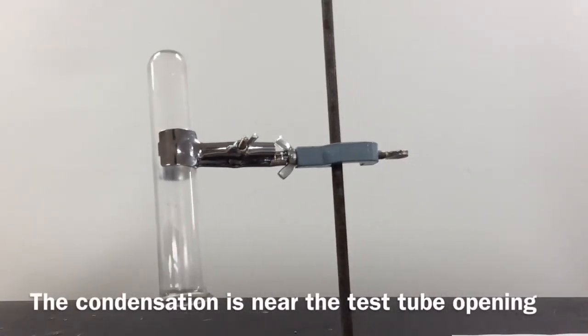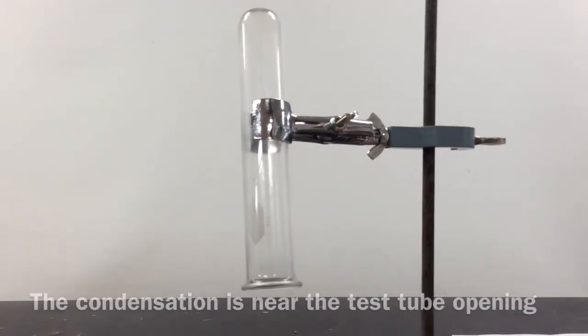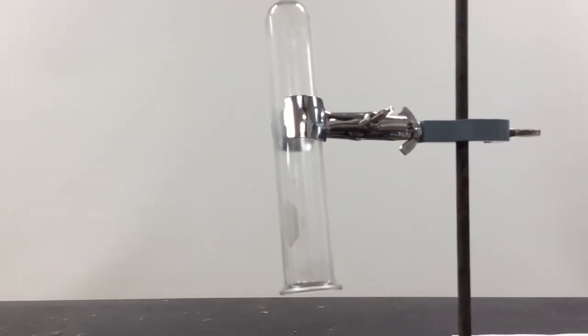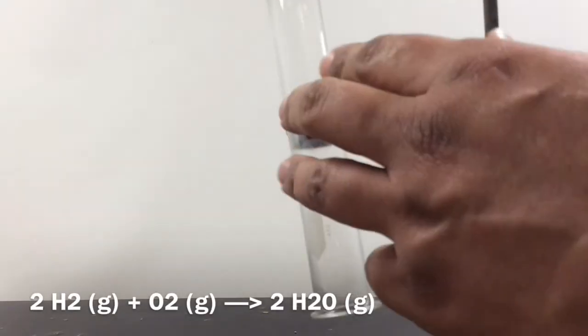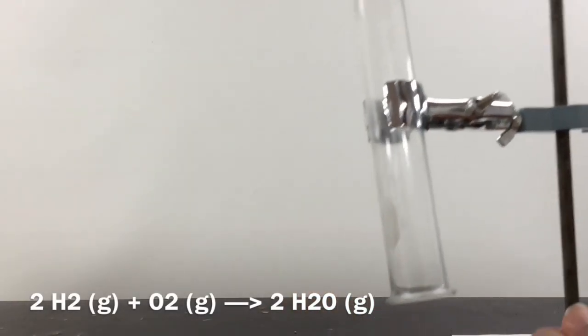It's a little hard to see on the camera, but right inside this test tube, there's a little bit of condensation, which tells us that that hydrogen burned, which means that it reacted with oxygen to form a little bit of water. And so it's a little hard to tell here, but we made a little bit of water.